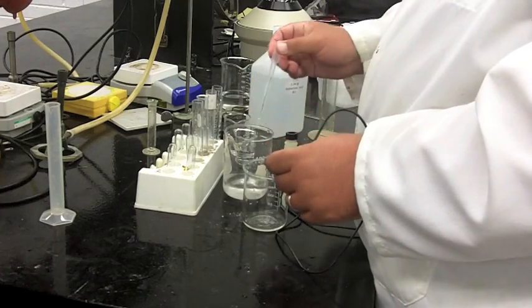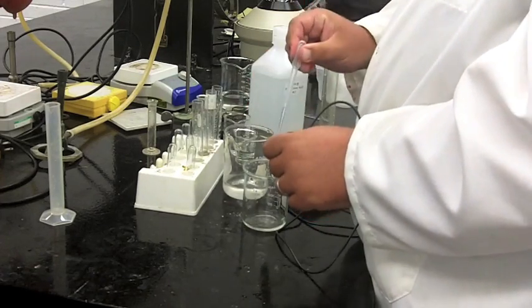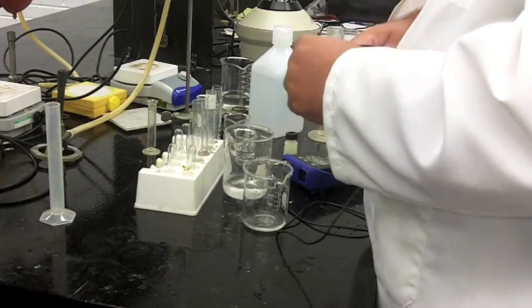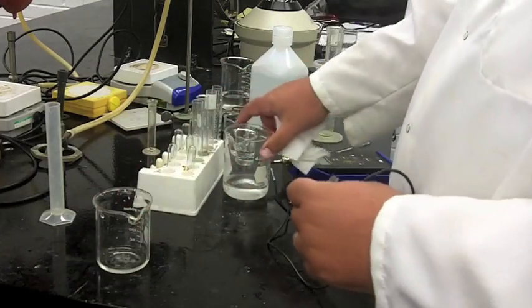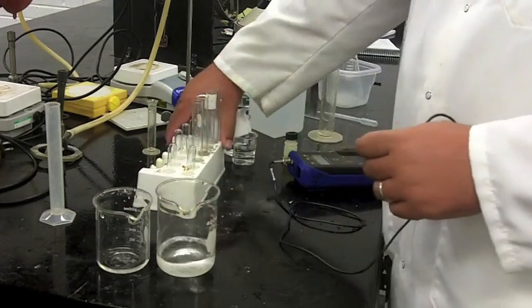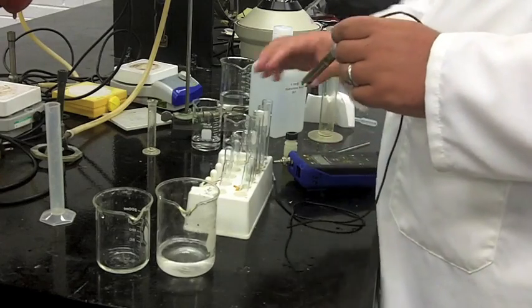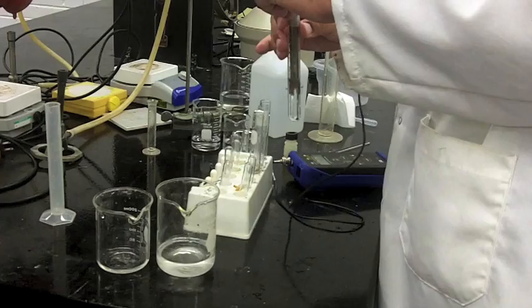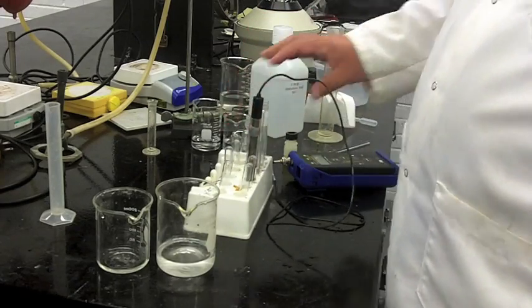Now, the pH meter needs a little rinsing. So you're going to take some DI water and use a dropper and just kind of squirt the end of it off. Usually what we do for accuracy then is sort of blot, don't wipe, sort of blot the probe dry. We'll show you how to use the pH meters once you see them, but basically you'll turn them on. They'll already be calibrated, and we will just then stick it into the test tube. They should fit pretty well. If they don't, we might need to put it into like a 50 ml beaker or something like that.